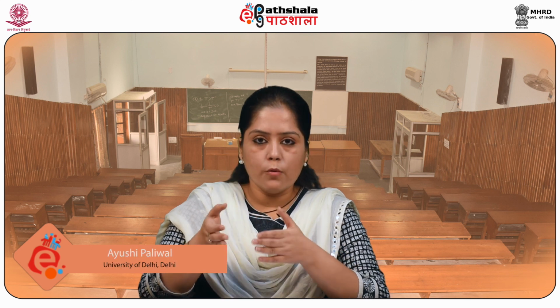Next, we discussed the schematic of the scanning tunneling microscope. Then we discussed the theory of STM, where we found the expression for tunneling current. Then we discussed the scanning tunneling spectroscopy obtained from STM. Lastly, the atomic manipulation which can be done with STM was discussed. Thank you.